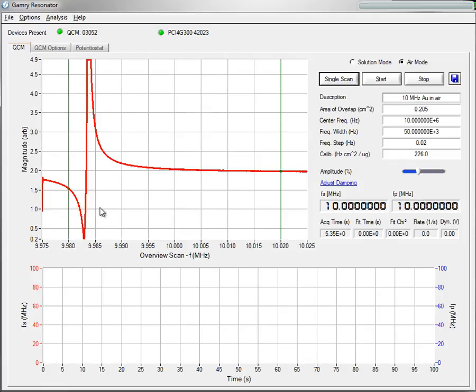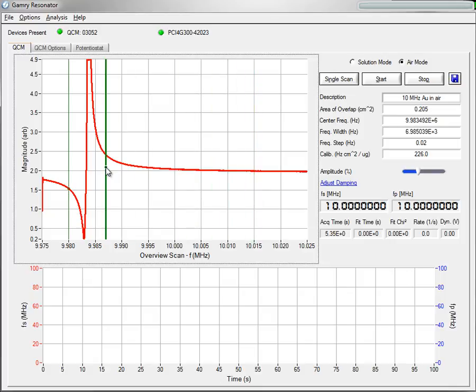As we can see, we found the resonant frequencies down a little below 10 MHz. And so that looks normal compared to our Solution Mode.